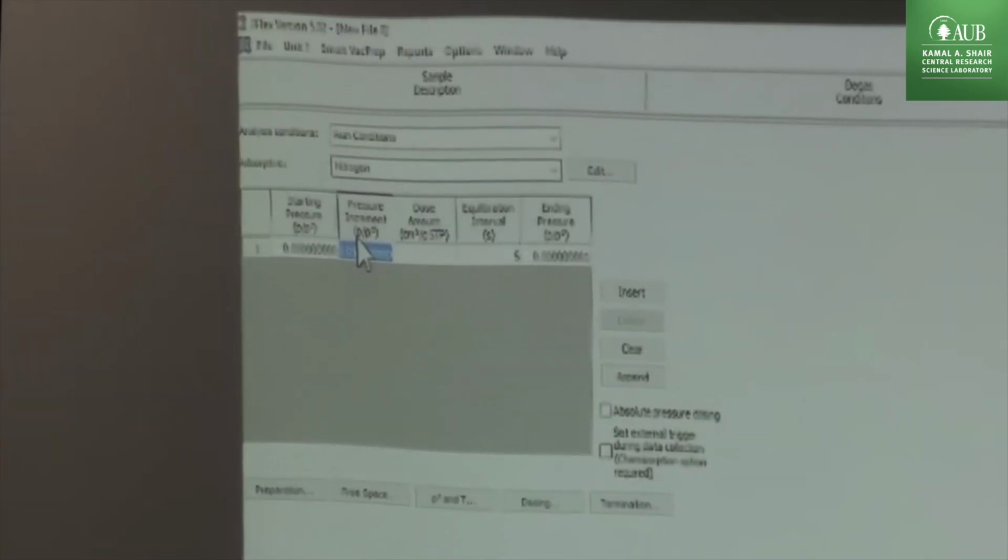As I said, you measure 1 point and 0.3, and then from the volume, you can get from the pressure or from the volume how many points you want to have. You divide, you get 100 milliliters up to 0.3. And if you have 100 points, you put those 1 milliliters, so you can get 100 points. So in any case, the pressure or the volume is the same.